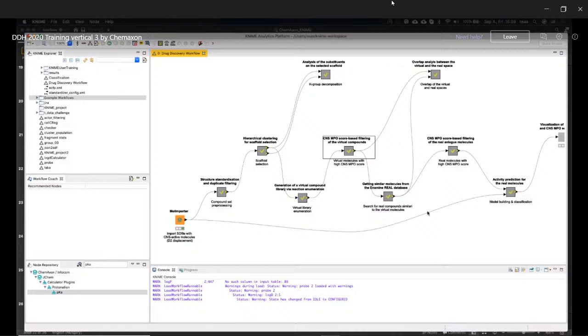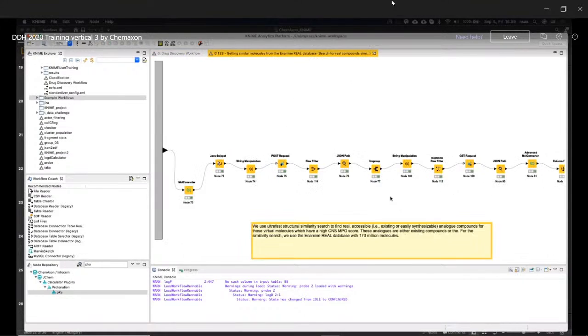And therefore, we are going to be using another ChemAxon tool, which is called MadFast Search. MadFast Search is basically a search engine that is very fast in comparing molecules with regards to their similarity, like how similar they are to each other. And this service is now available for us through a web service call. That's the easiest way we can use it from KNIME, for example. And therefore, we can actually ask this service.